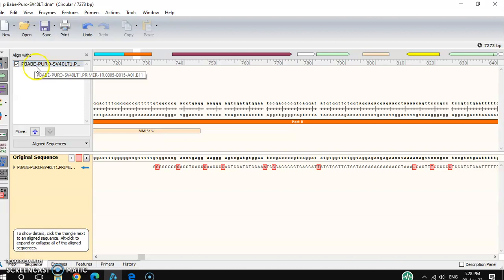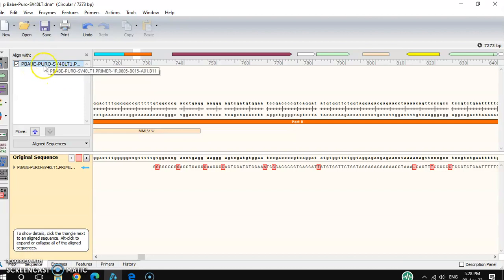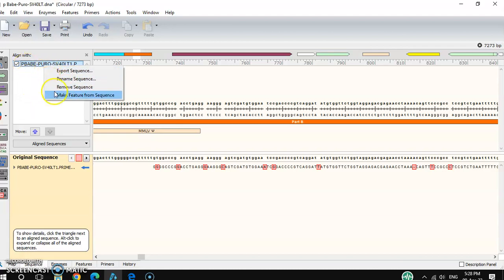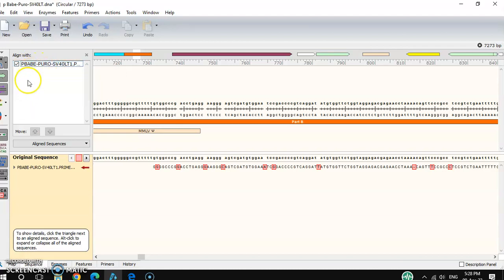In the pop-up window you can see details about the sequencing result. If you would like to rename it, you can right-click and rename it. If you'd like to remove this sequence, you can also remove it from here.